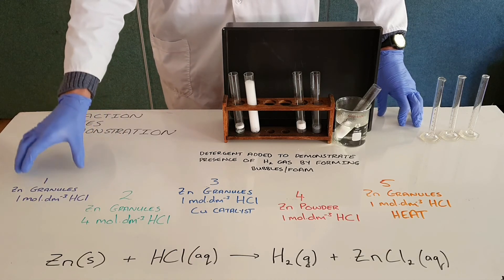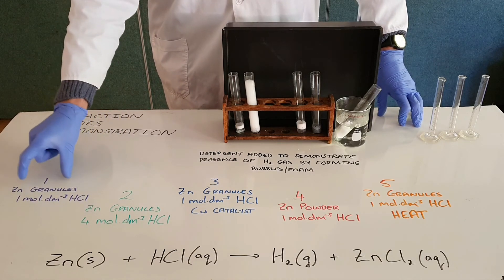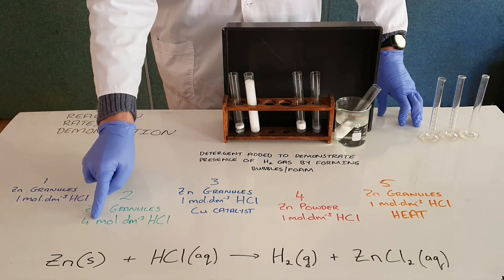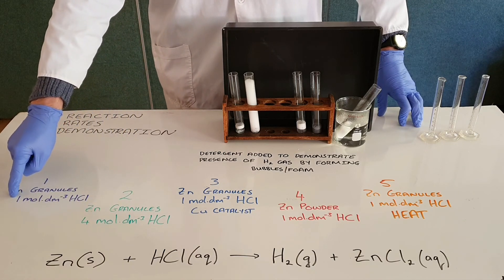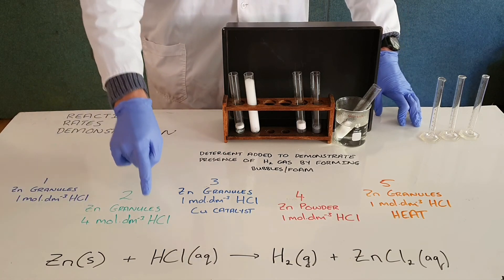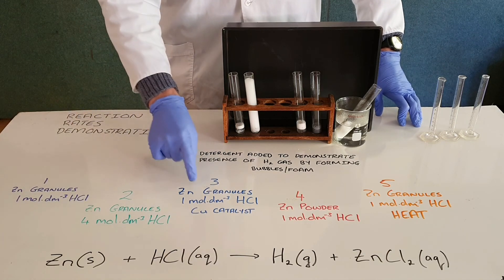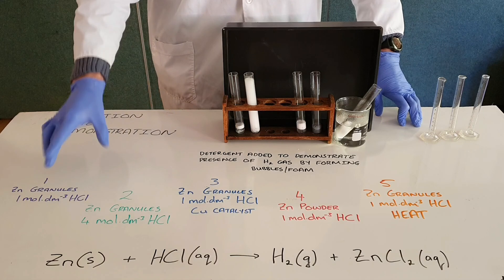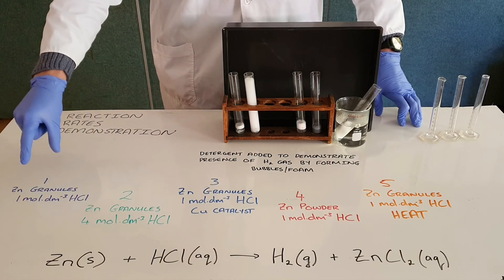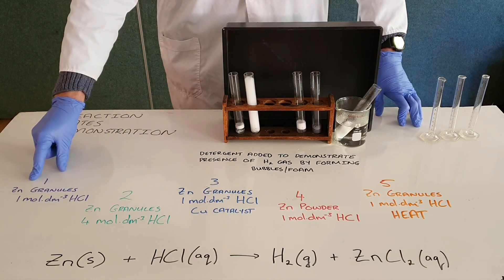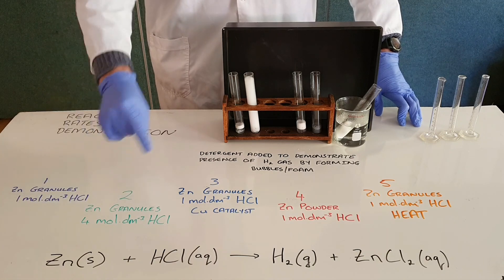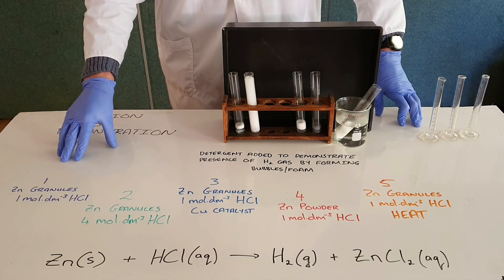This allows us to easily tell the difference between why this reaction is slower than this one, because the only change is a concentration change. We can compare this reaction to this reaction to this reaction because the only difference here is a catalyst. In the same way, that is why it's so important to have a controlled test tube which allows you to make individual changes for comparison sake.